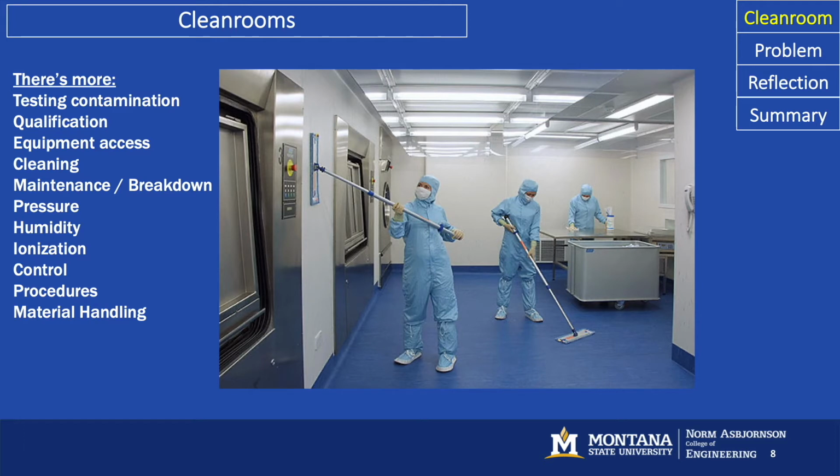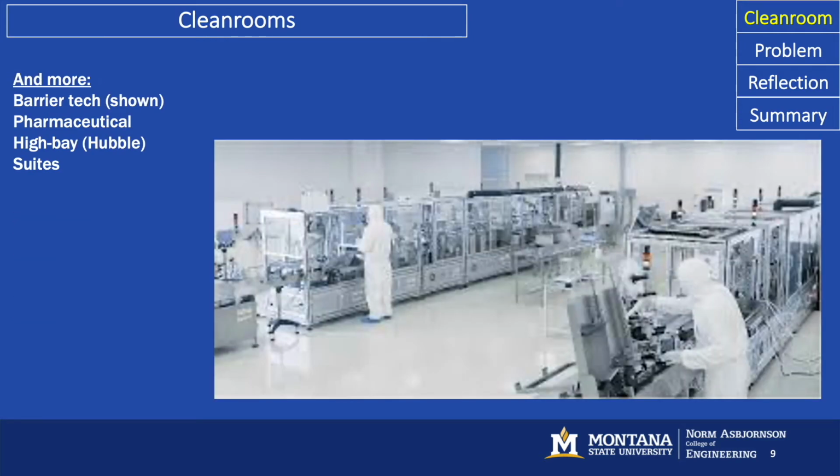In addition to these complications to having a good clean room design, there's completely unique other ways of approaching a clean room. Like take a look at this one right here. This is fairly prevalent, so I'm going to focus on it for a minute. Here you see several people in a really large clean room and what looks like machines. Well, those machines are actually an even cleaner clean room within the big clean room.